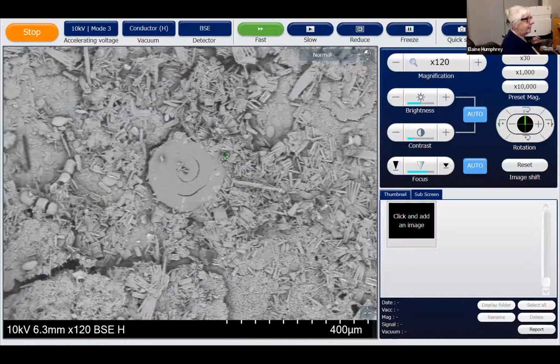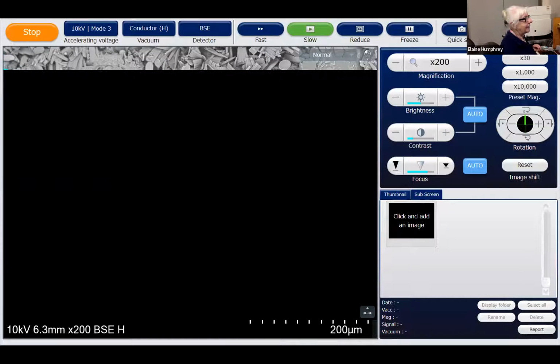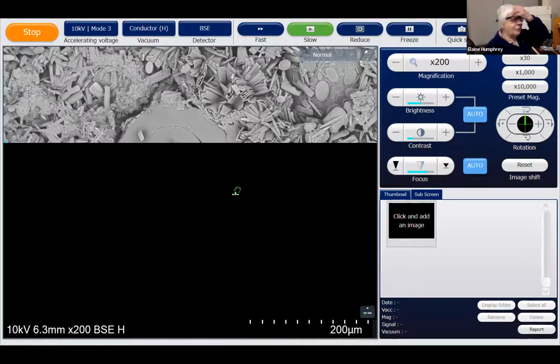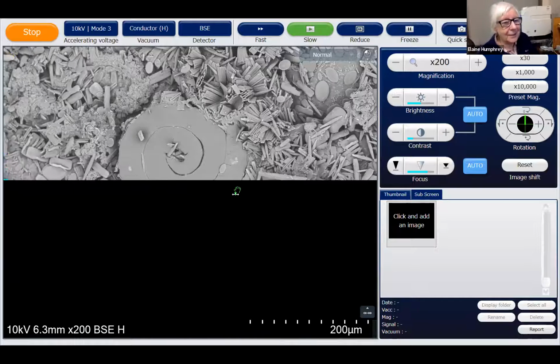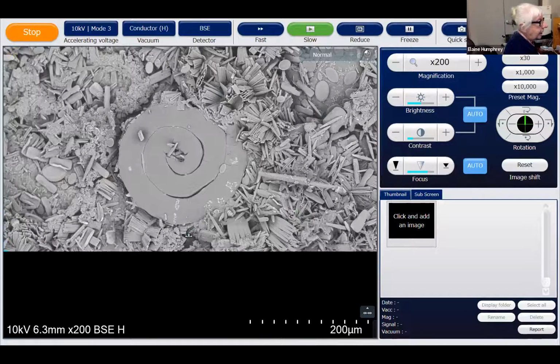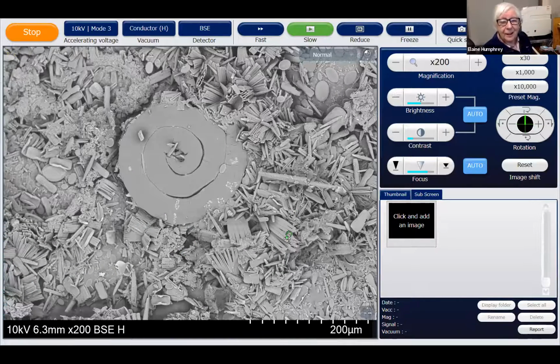And we can zoom in on that. Yeah. Hey, look at that. I didn't know it. And look at all these French fries. And the French fries have a scientific name, tabularia. Most of them are tabularia. But they're also the tines on a fork. The kids all say what they think they are.